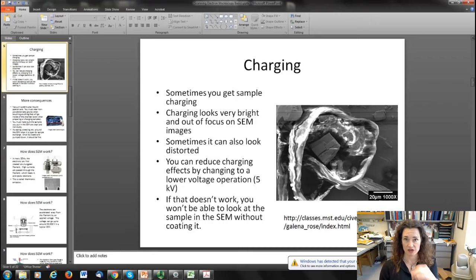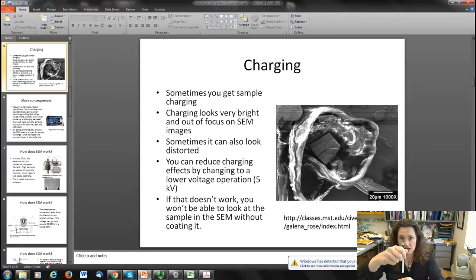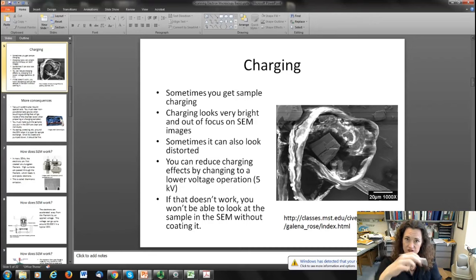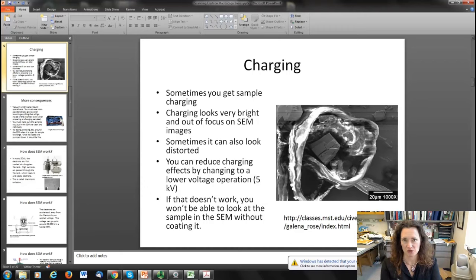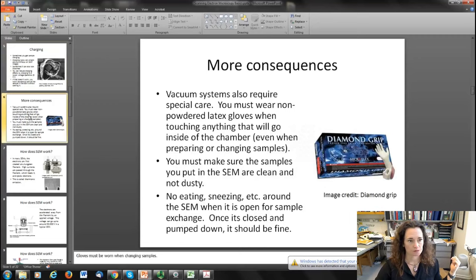Bright images in charging are caused by a negative charge on your sample — the incoming beam sees that negative charge and reflects many more electrons before reaching the sample. You'll see really bright regions with negative charge and really dark regions with positive charge, because your electrons come in, hit the sample, and won't escape — they get sucked in. That looks dark on an SEM image.